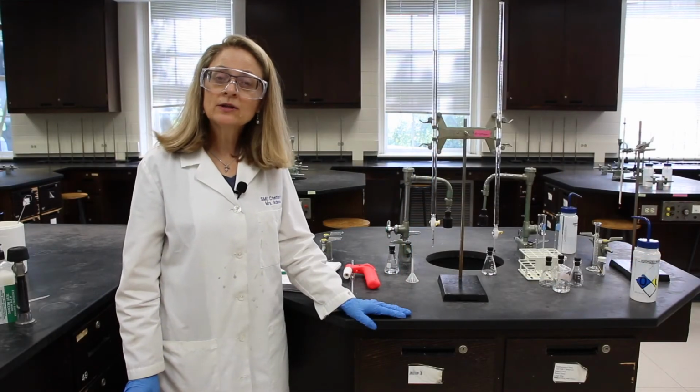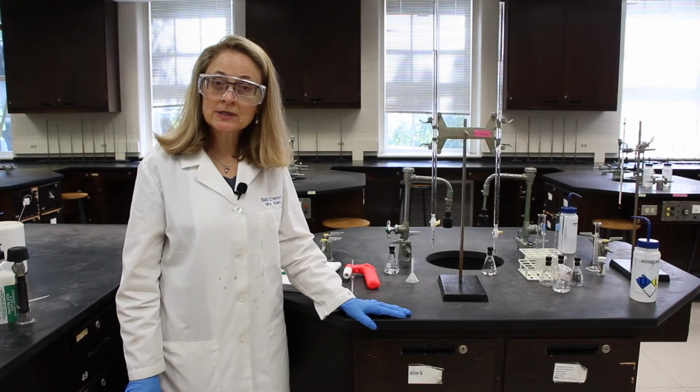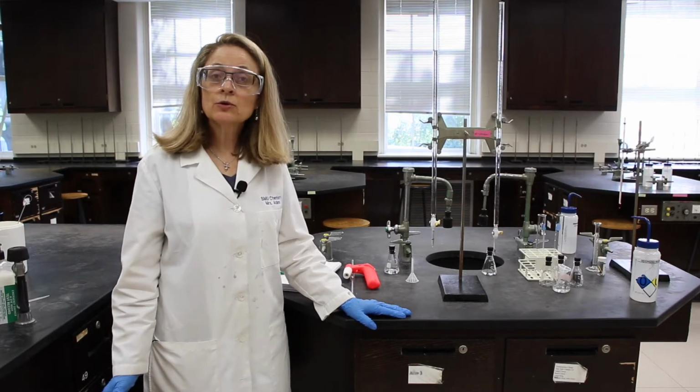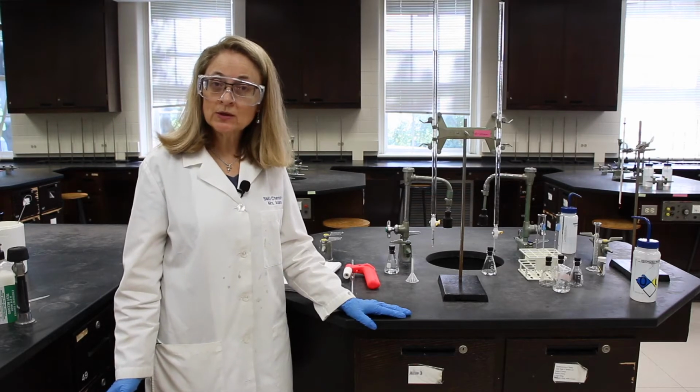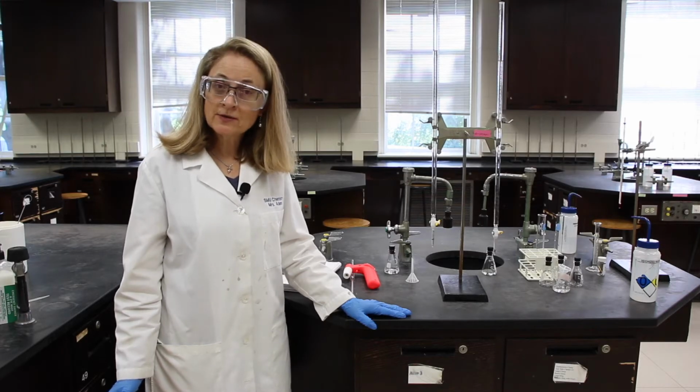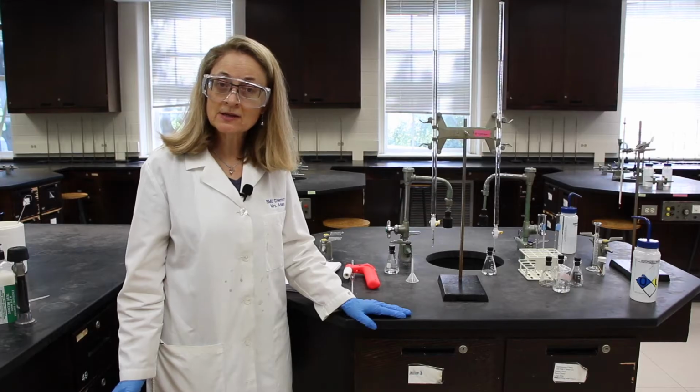You can now calculate the densities of pure DI water and pure 2-propanol. You don't have to show your work, but please include units in your final answer. Please pause the video while you're calculating the densities.